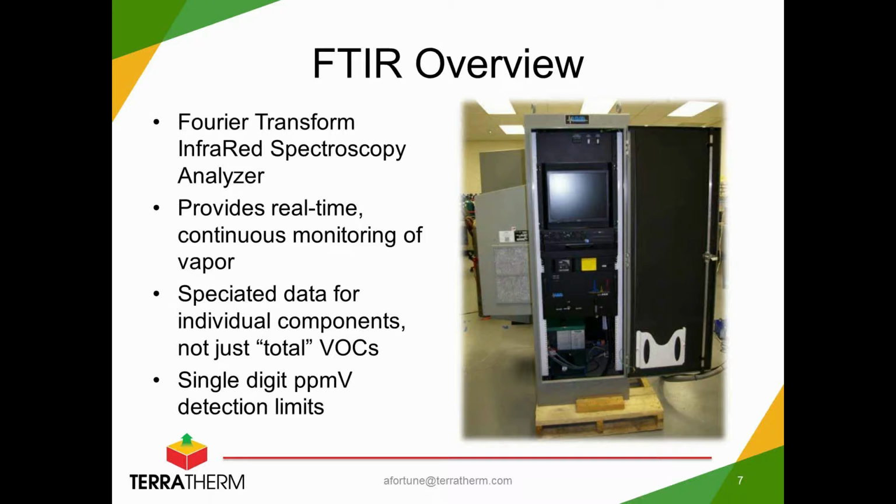So just to go over what the FTIR is, here's a photograph of the unit in its NEMA enclosure. FTIR stands for, like I mentioned before, Fourier transform infrared spectroscopy, and this is a real-time analyzer. The Fourier transform portion of the word refers to an algorithm that is used for calculation purposes, and the infrared spectroscopy is the actual measurement technique.